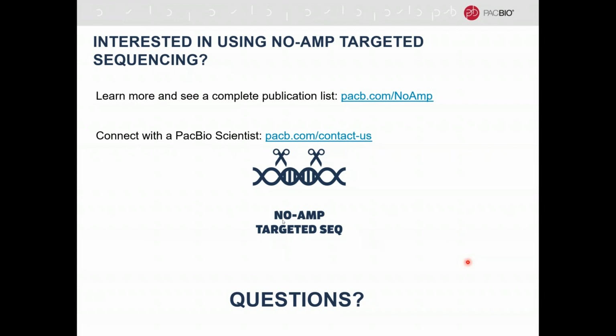There is a question about multiplexing. With 1 microgram of DNA, can I analyze multiple sites, or shall I use 1 microgram for each target? This is actually per sample. So you can analyze several different targets with the same microgram. It's just per sample that you calculate that 1 microgram. But of course, you have to think about the total amount of on-target calls that you're going to get then being split up. But yeah, you're really looking at per sample.